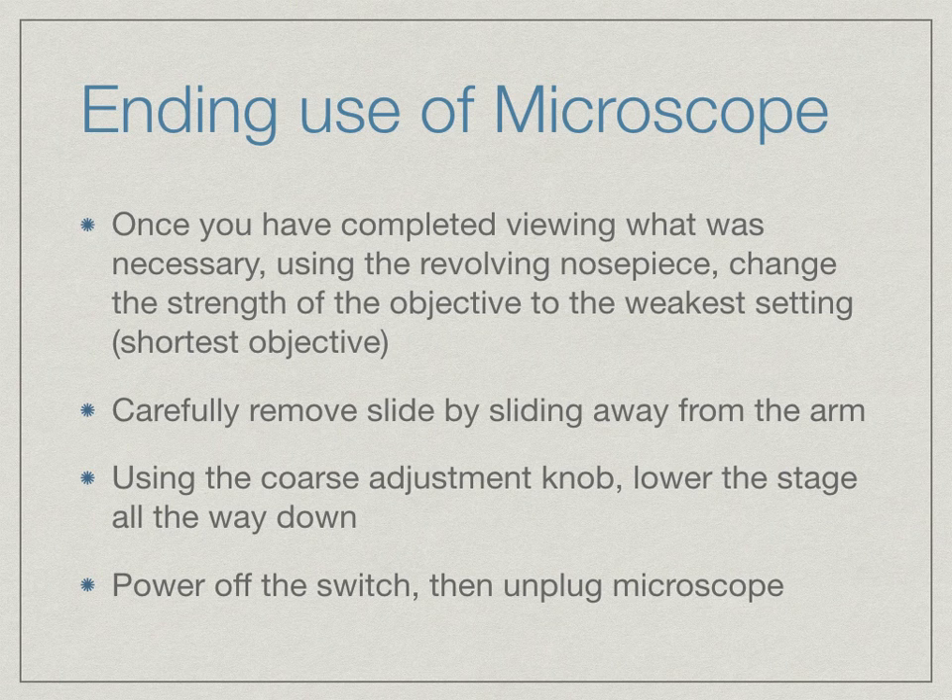Once you have completed viewing and your use of the microscope is over, use the revolving nose piece to change the objective back to the weakest setting — the shortest objective. Carefully remove the slide by sliding it away from the arm. Using the coarse adjustment knob, lower the stage all the way down. Note: use the coarse adjustment knob, not the fine adjustment knob, when ending. Then power off the switch and unplug the microscope.